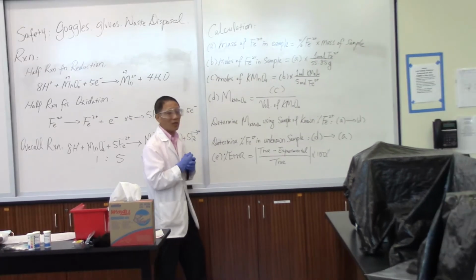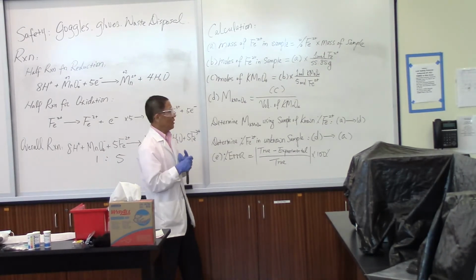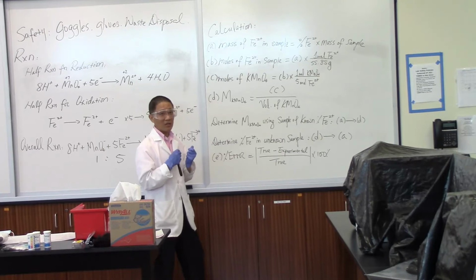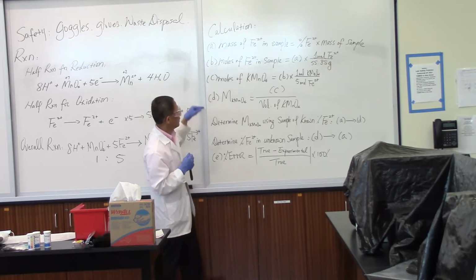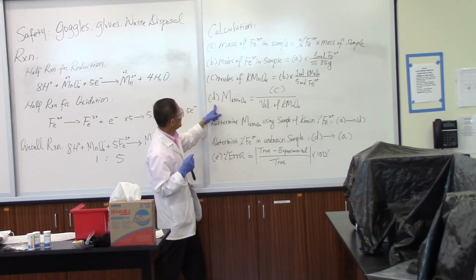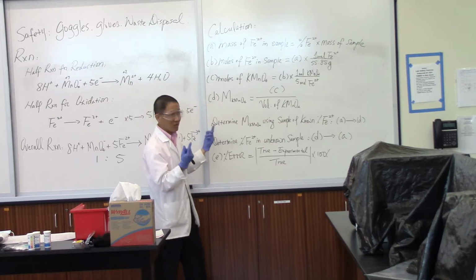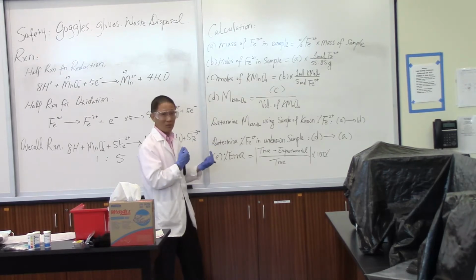The sample calculation given to you on page 4 of the lab manual is for figuring out the percentage. So here, going from A through D, we are trying to determine the molarity. And going from D through A, we can determine the percentage. So these two processes are opposite of one another.